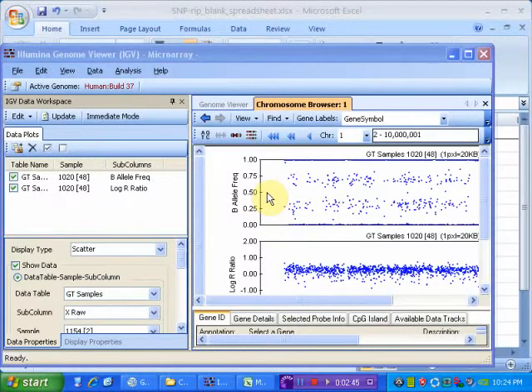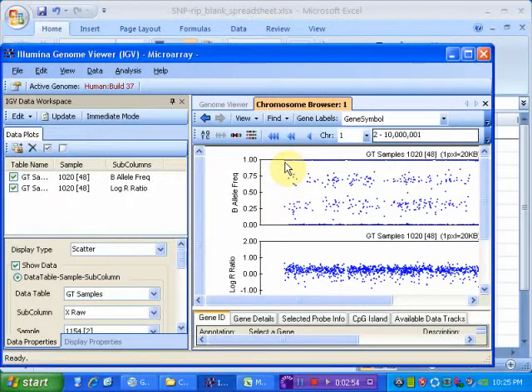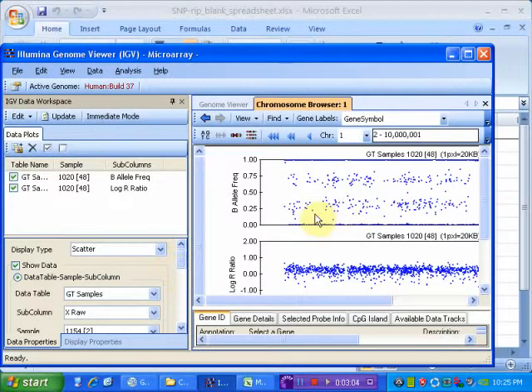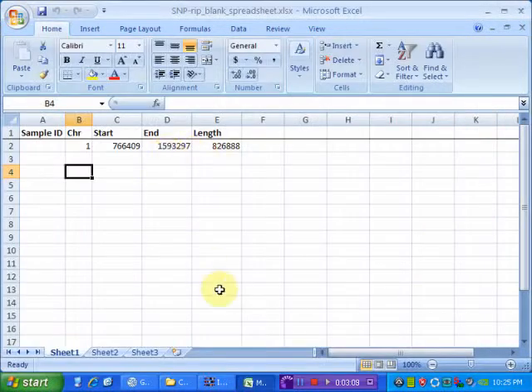Okay, so now I'm going to start copying values from these dots. If I wanted to, I could go manually over the dot until the tooltip pops up, and then press F2, and that's recorded the value in the background. I could manually go to the next one with the mouse, press F2, and it's done the same.